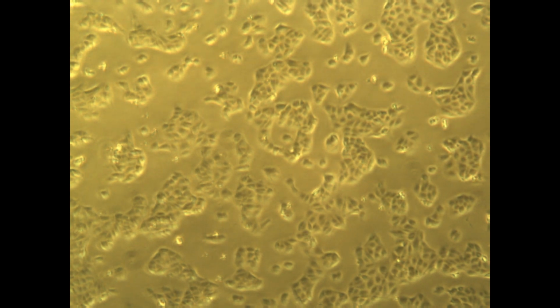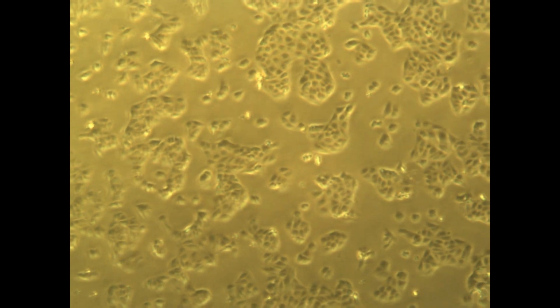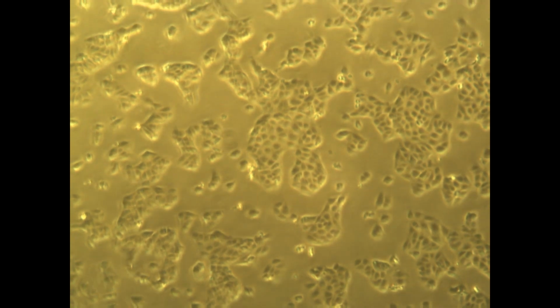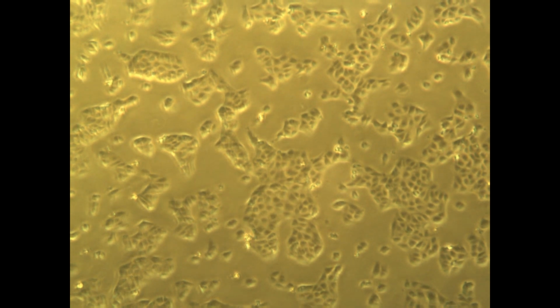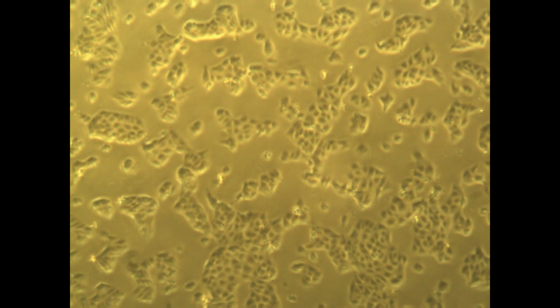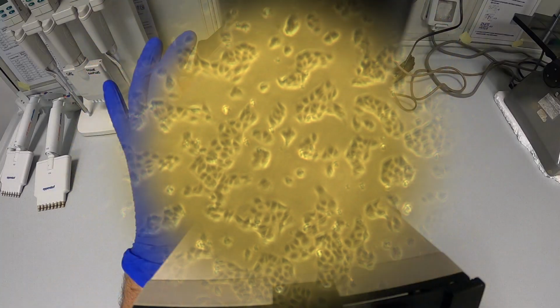Whenever you sit behind the microscope, immediately put your hand on the focus adjustment knob, and with the other hand you can start moving the flask around, or the dish, or whatever you have, in order to find the cells, because you will see them moving and be able to focus on them. These look like very beautiful MDCK cells. They're nice colonies and the cells look fine.